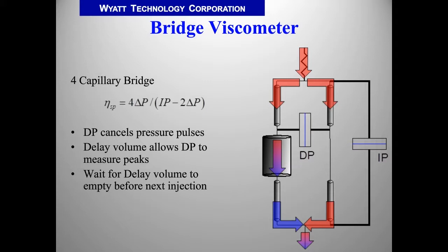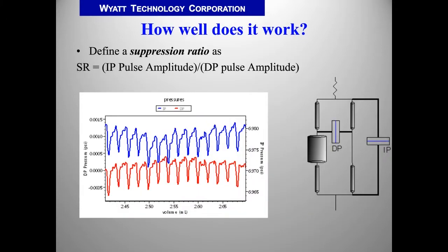Now, one side effect of the bridge is that the sample goes into this holdup volume, and you have to wait for it to come back out again before you can make another chromatography injection. So let's talk about how well that works. Now, remember, the benefit is we're going to have the ability to cancel pump pulses.